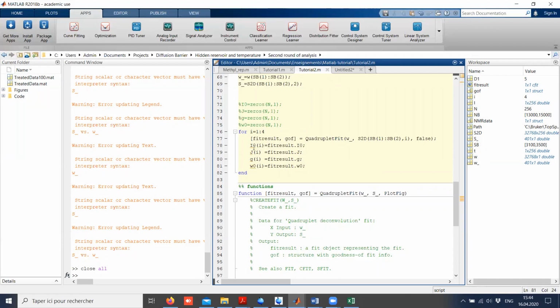You see now, Stuart, this is underlined in red, and MATLAB is not happy because it tells me that the size of the vector will change size on every loop iteration. So whenever it goes here, MATLAB will have to resize these vectors and allocate space for them.